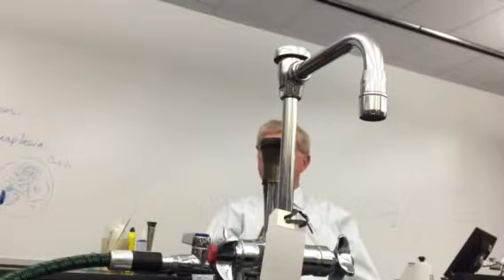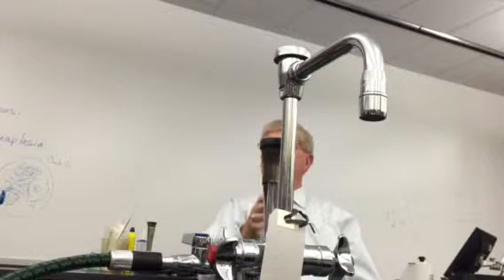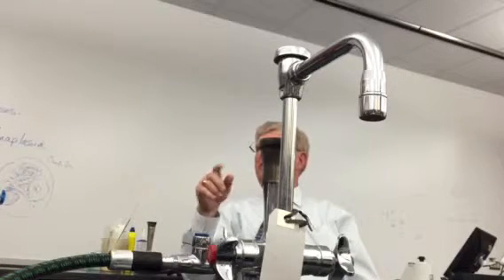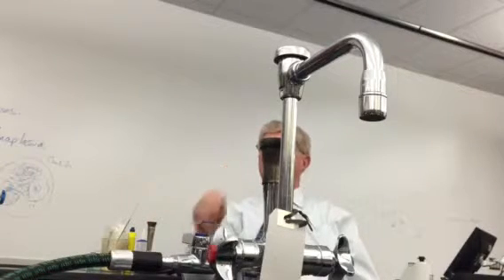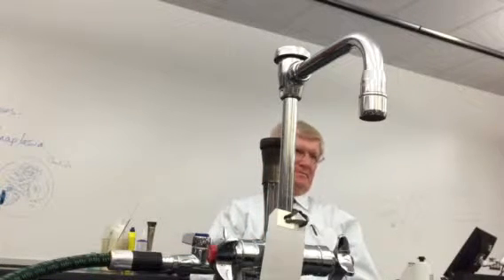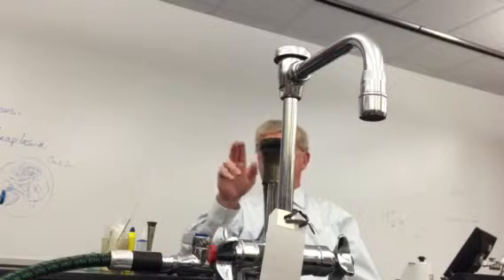There are 6 columns: the name of the medium, what's important in that medium, what biochemical reaction we are looking for, end products, and positive and negative results. That's it. And that was 2 weeks' worth of lab.